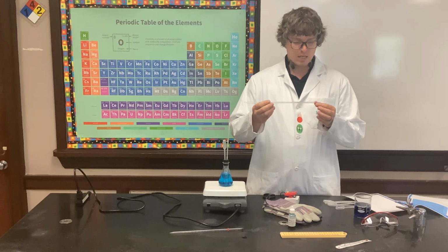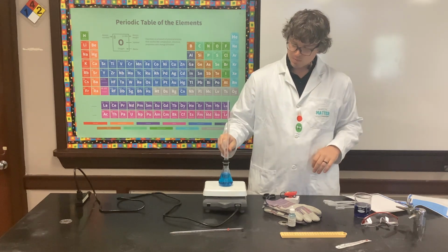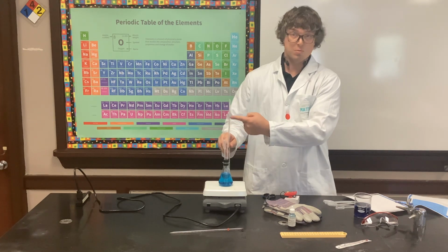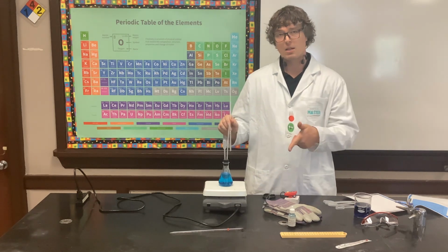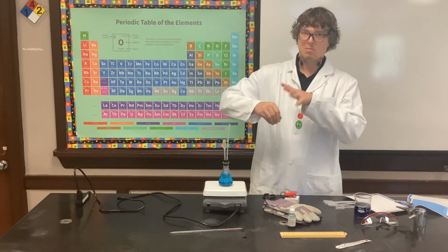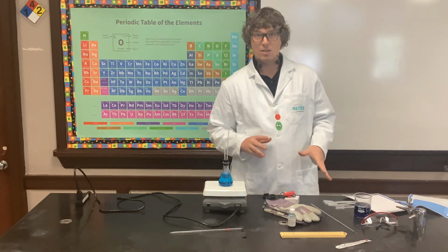Then it also wants you to get a glass tube. This looks like a big stir rod, but it's actually hollow. This is what they suggest putting in there because you need a long tube to give water some room to travel. I found these incredibly difficult to put into the stoppers, unless you're planning on expanding the hole. Plus, I was always scared as I was pushing it in that it was going to break and I'd get cut.